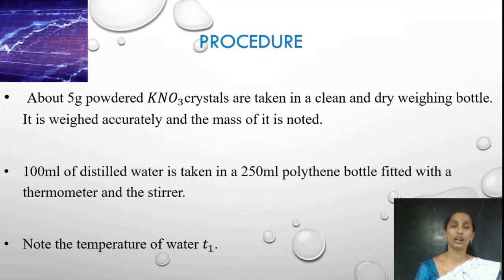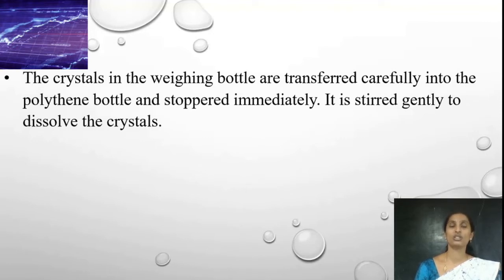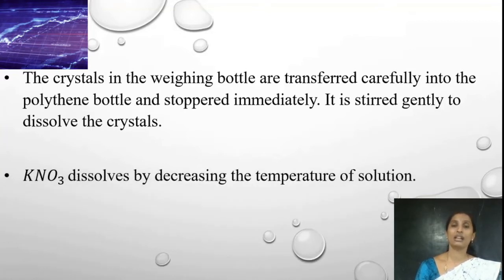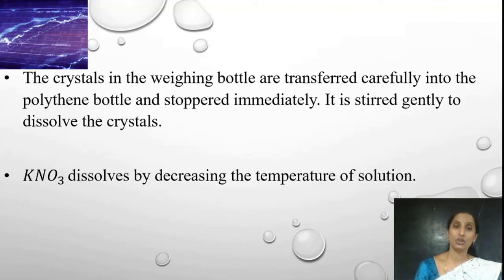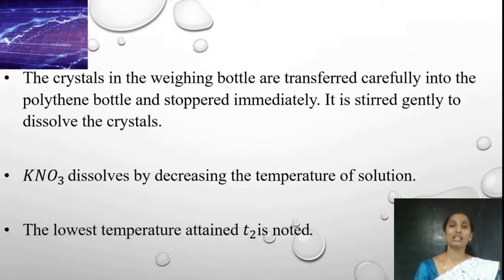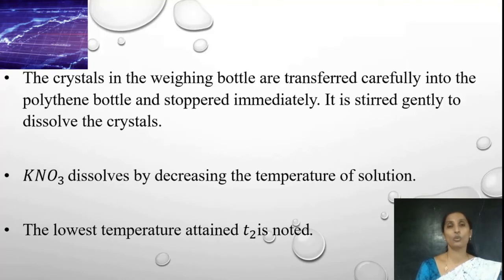Once the temperature of the water is recorded, the next step is to carefully transfer the crystals of potassium nitrate from the weighing bottle into the polythene bottle and stop it immediately. Stir gently to dissolve the crystals. Once the potassium nitrate dissolves, the temperature of the solution decreases, which can be felt when holding the polythene bottle. Once the temperature remains constant after complete dissolution of potassium nitrate, note down the temperature of the solution — it will be the lowest temperature. This is recorded as T2. With T1 and T2, we can proceed to the calculation to determine whether heat is absorbed or liberated.